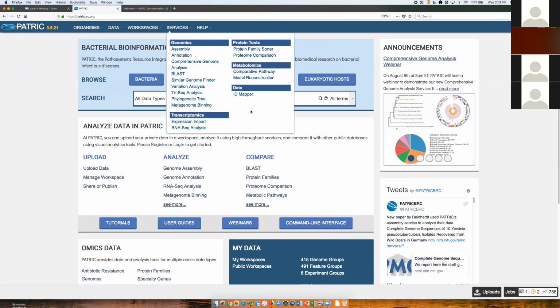And when we started with giving these different computational pipelines to the people who use PATRIC, we generally try to choose things that biological researchers would have trouble with. Like doing an assembly is often pretty difficult. If you're doing something with spades, you have to download the pipeline, you have to learn to run it, you have to learn how to run it on your reads and interpret the results. So we are trying to make life easier for our users.